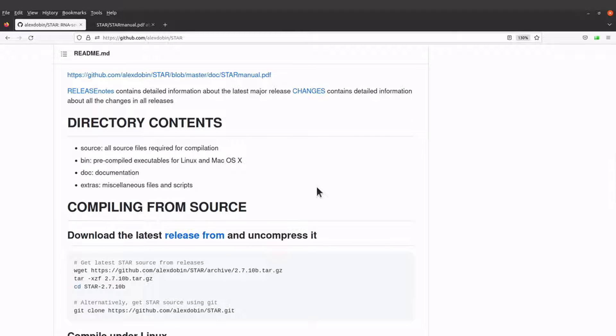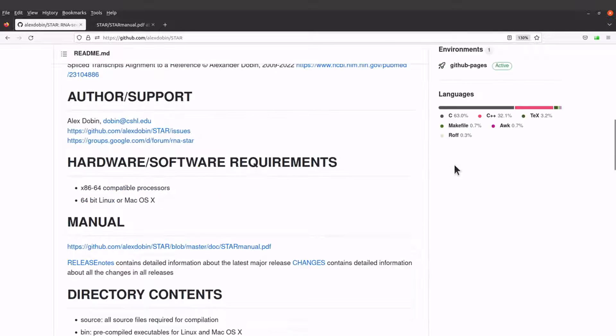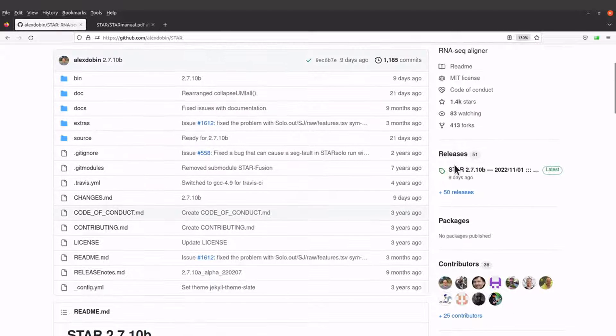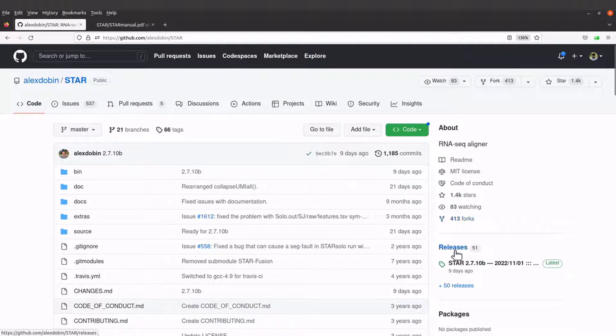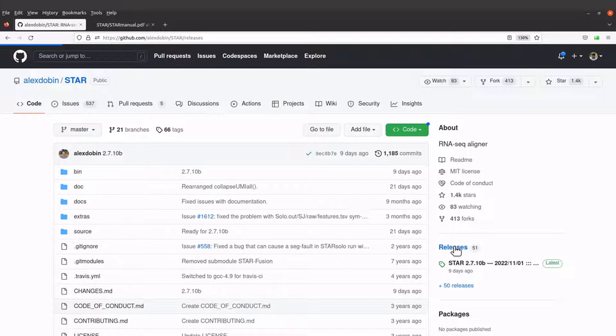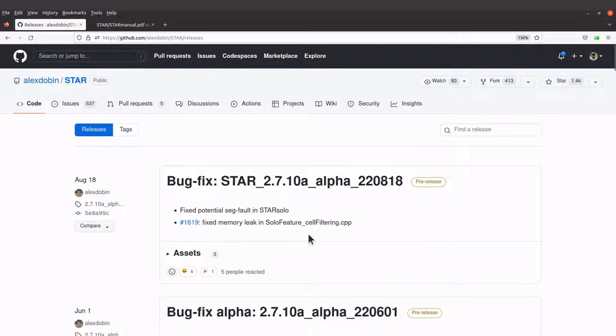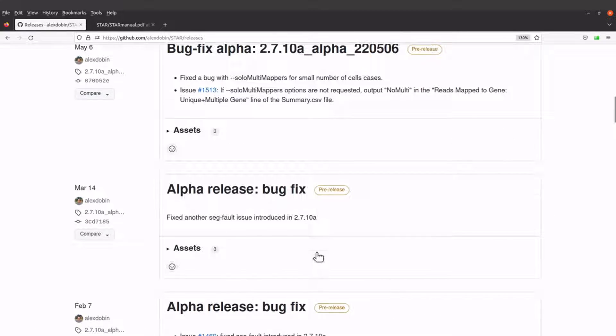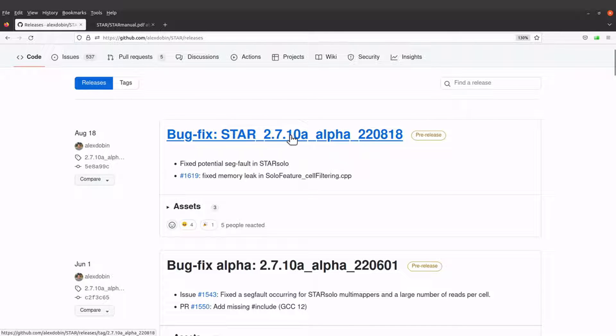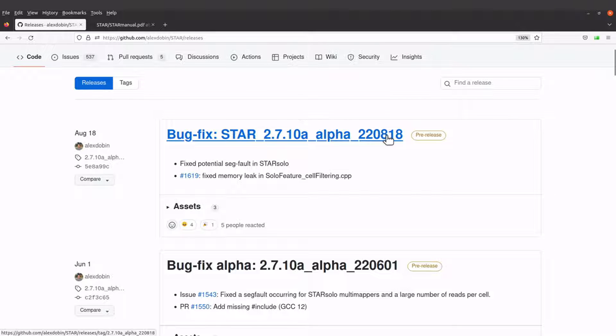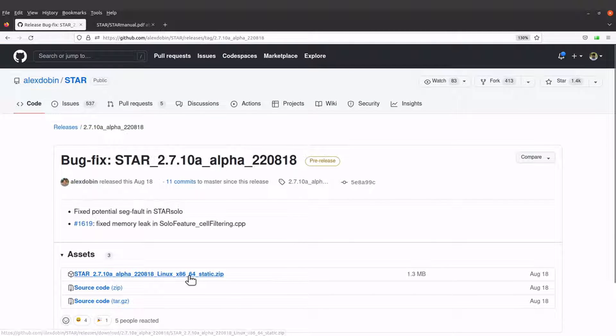First of all, we need to get the executables, so we have to go to the releases page. Let's scroll up and then let's go to the releases page. This is the latest release, but I want us to use this one here. So click on releases and then this will give us the latest release as well as the previous releases. But we will use this one here, the 2.7.10a, this one here which is 220818.